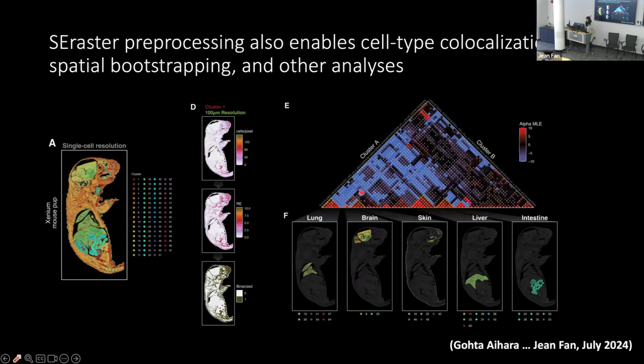in this case, what I'm visualizing is for each transcriptionally distinct cluster of cells that we identify, if we evaluate their co-occurrence, red is high co-occurrence, blue is low co-occurrence, you can see it forms these little triangles. I guess they look kind of like TADs for those who like TADs. But essentially, it's representing similar things where these cell types are more likely to be spatially observed together. And if you visualize where they are, perhaps unsurprisingly, they correspond to different organs. So we're very nicely able to recapitulate that, the different cell types co-localize together because they're functionally distinct in different organs.